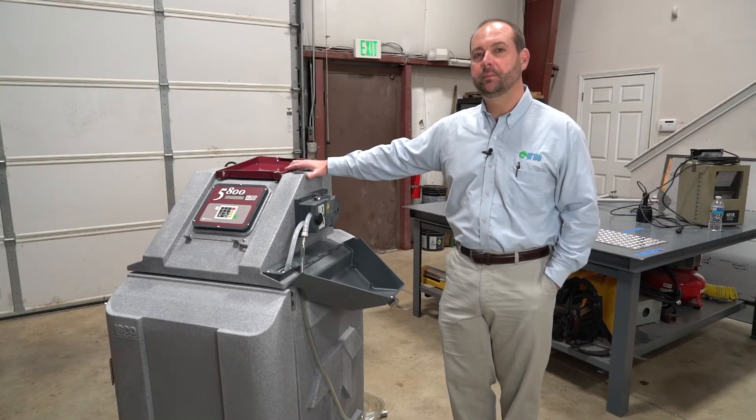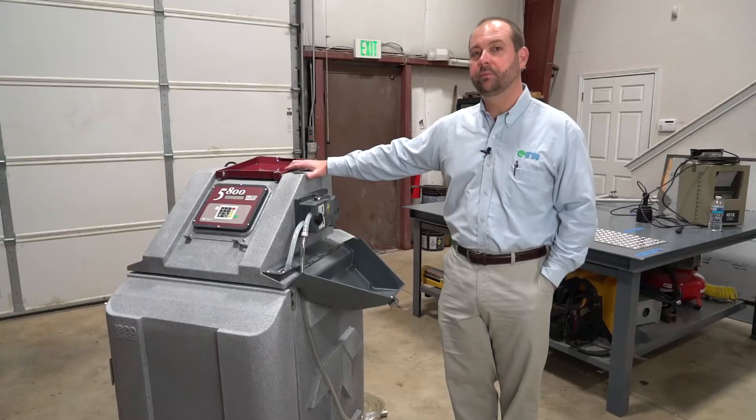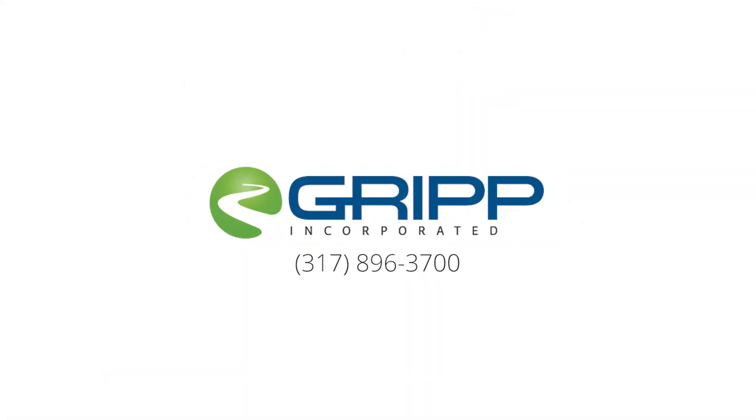You have now successfully completed the installation of a replacement pump tube in a Teledyne ISCO 5800 refrigerated sampler. If you have any questions, please give us a call at the office — we will be more than happy to help.